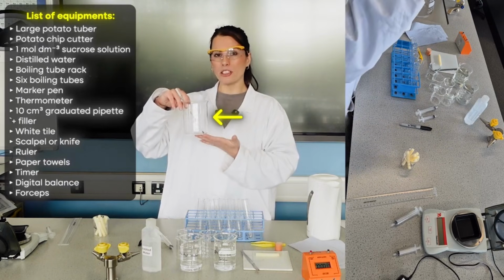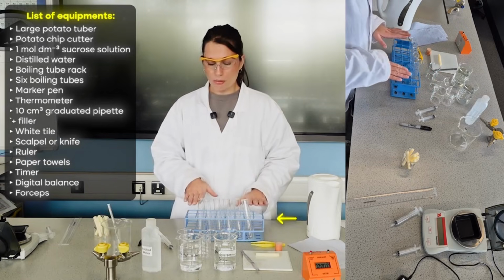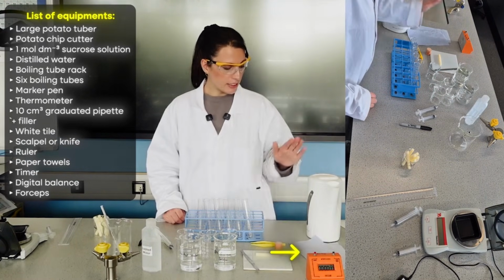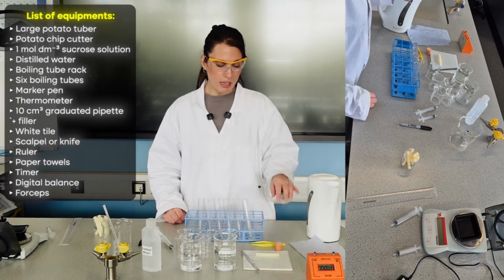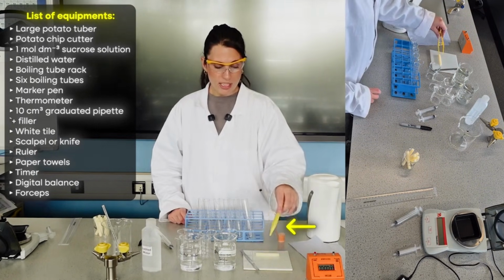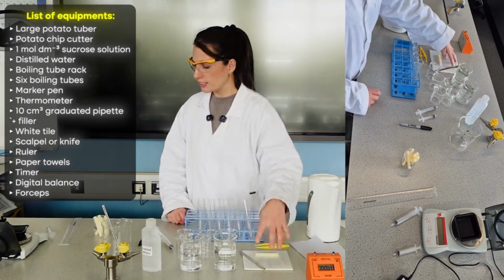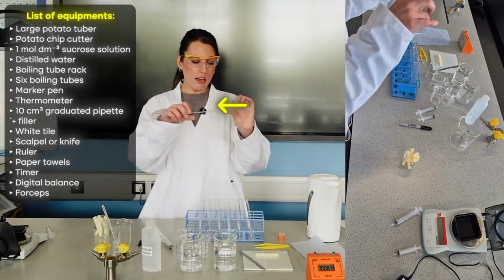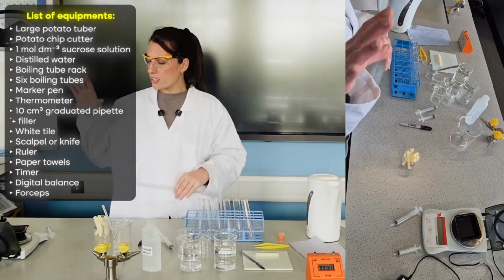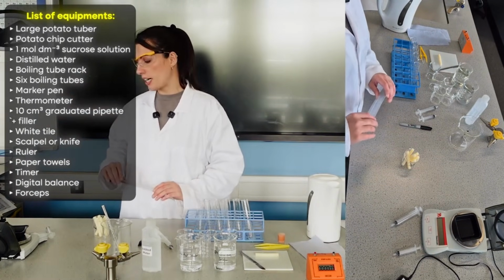I've got a large 500 milliliter beaker here and a thermometer, which will act as my water bath. I've got my boiling tube rack for my boiling tubes, stop clock, tissue for blotting, kettle with the hot water for the water bath. I've got the bung to put on for the mixing in between the serial dilutions, forceps to get the potato in and out of the boiling tubes, white tile and scalpel for the cutting. And then I've also got a ruler so that I can measure the initial length and final length, as well as I've got my balance here to measure the initial and final mass of each potato as well.